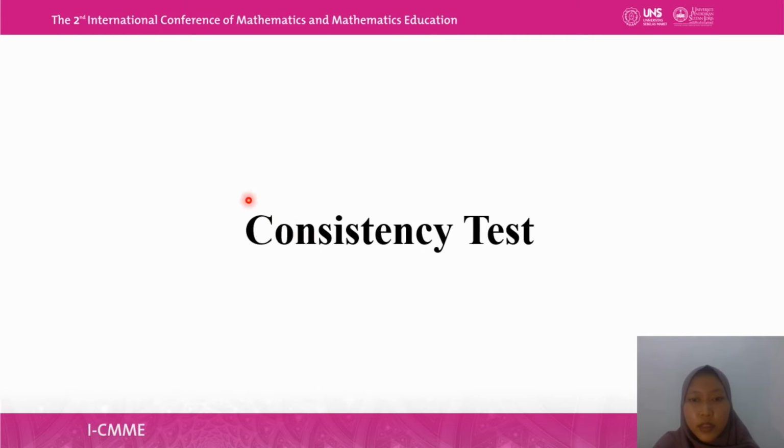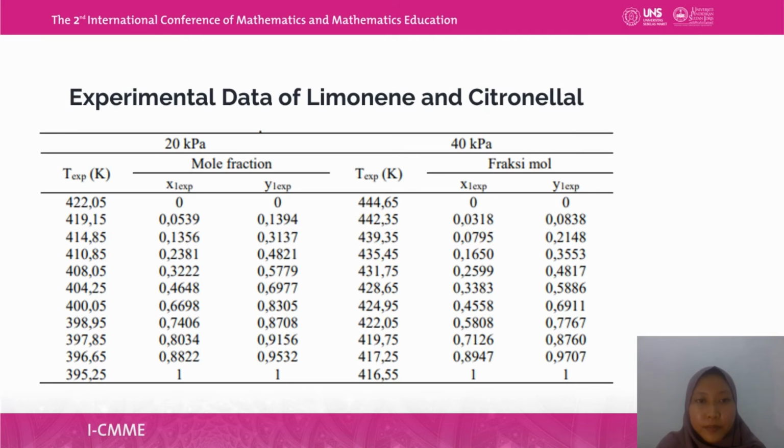Next, consistency test. Okay, this is experimental data of limonene and citronellal at 20 kPa and 40 kPa after analysis by gas chromatography.